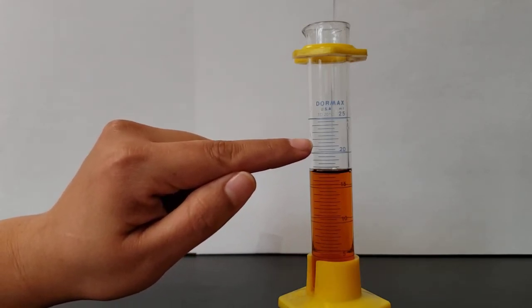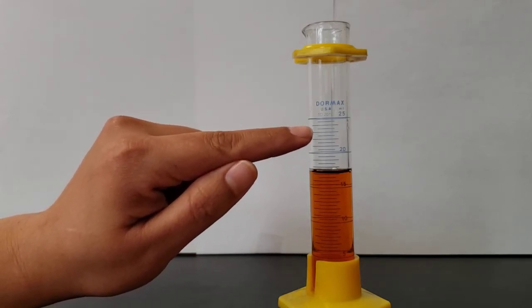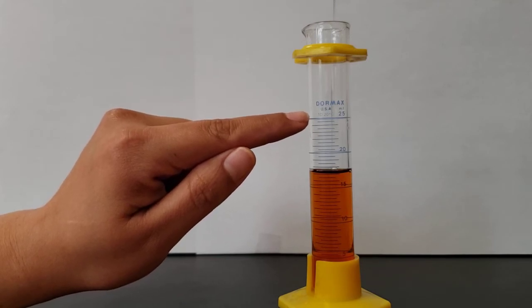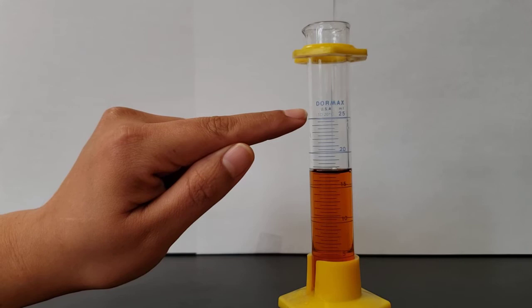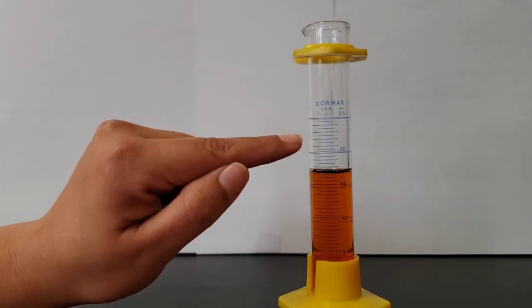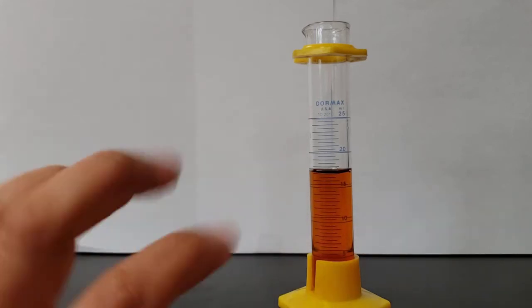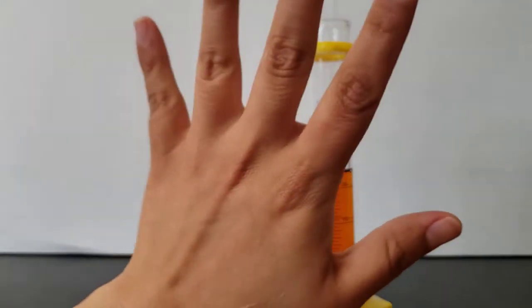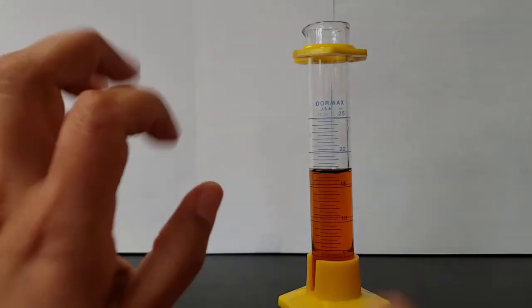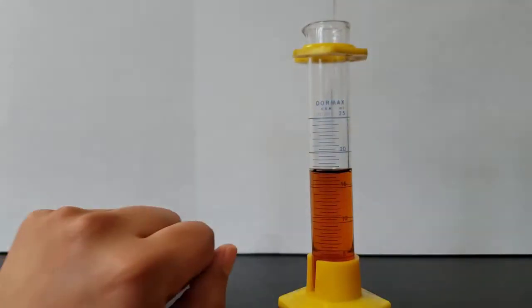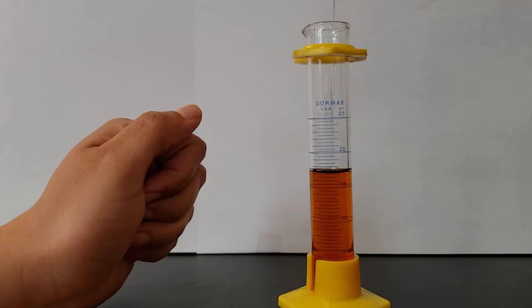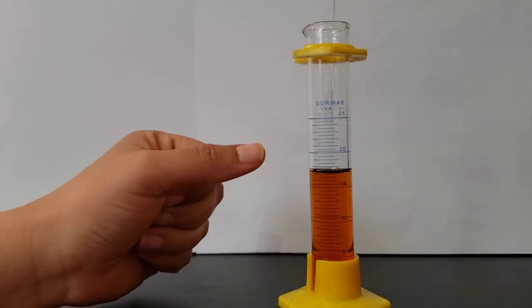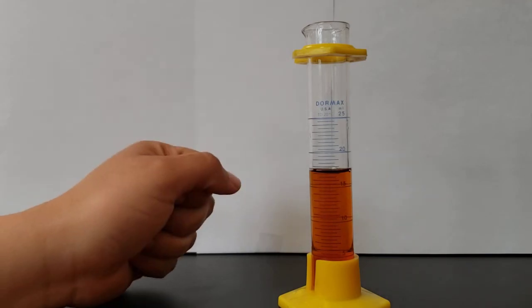So 1, 2, 3, 4, 5, 6, 7, 8, 9 lines, and then additional 10th space to 25. So that means we are taking these 5 milliliters and we're dividing it into 10 chunks, right? So 5 divided by 10, and that tells us how many milliliters each of these lines represents. So go ahead and take a second to type in 5 divided by 10 into your calculator to see how much each of these lines represents.